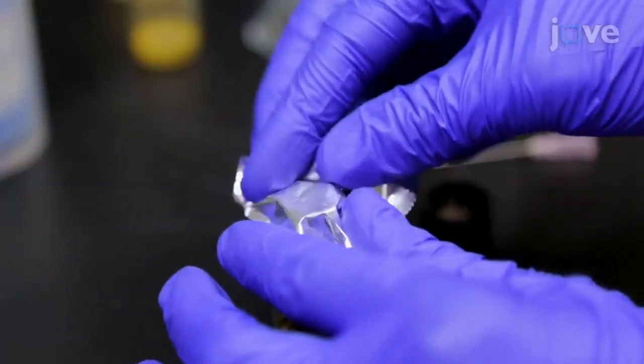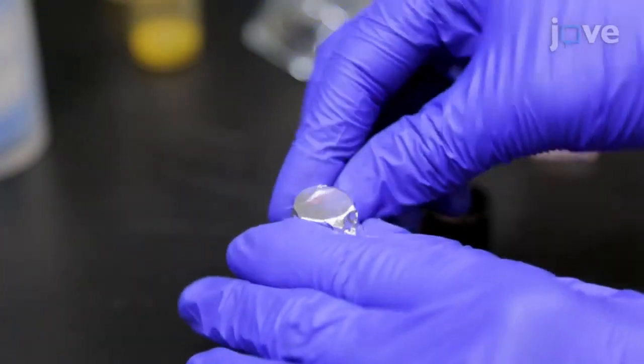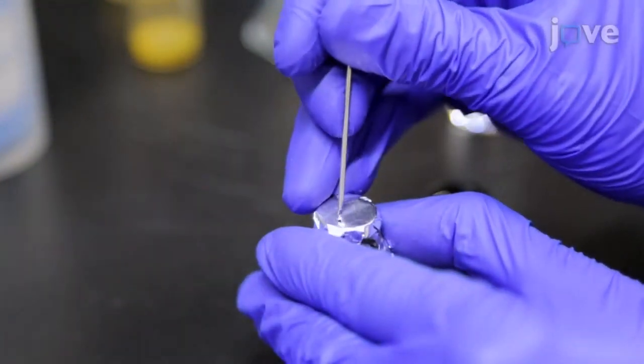Then, cover the vial with aluminum foil and punch several holes in the foil with a needle.